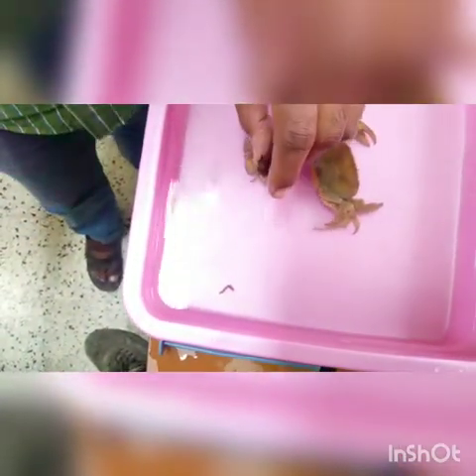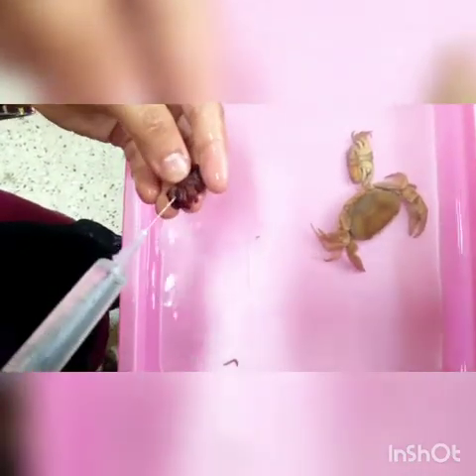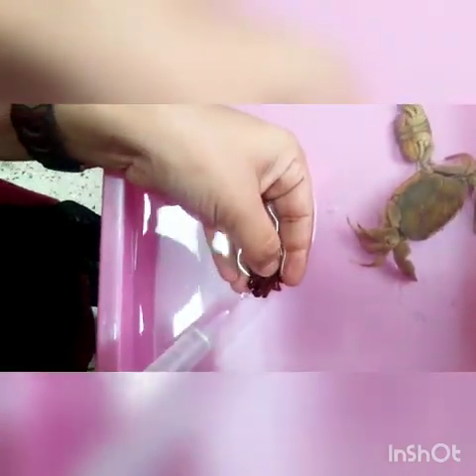You can inject through its mouth as well. Keep it inside the water, then inject. Let's check it out.